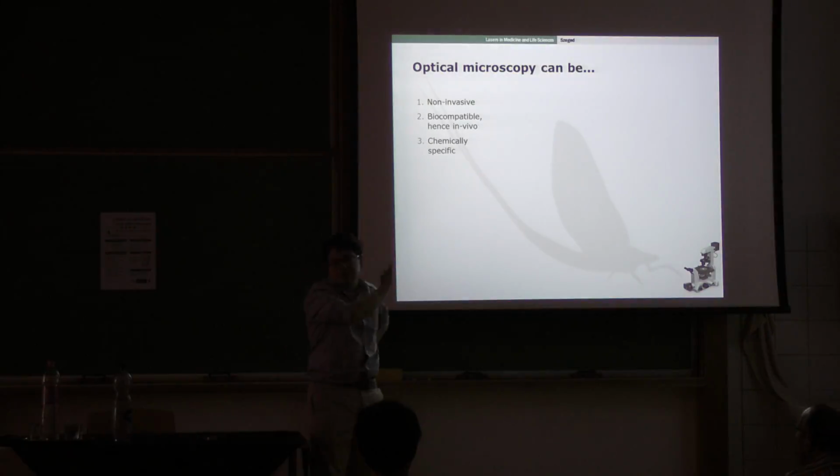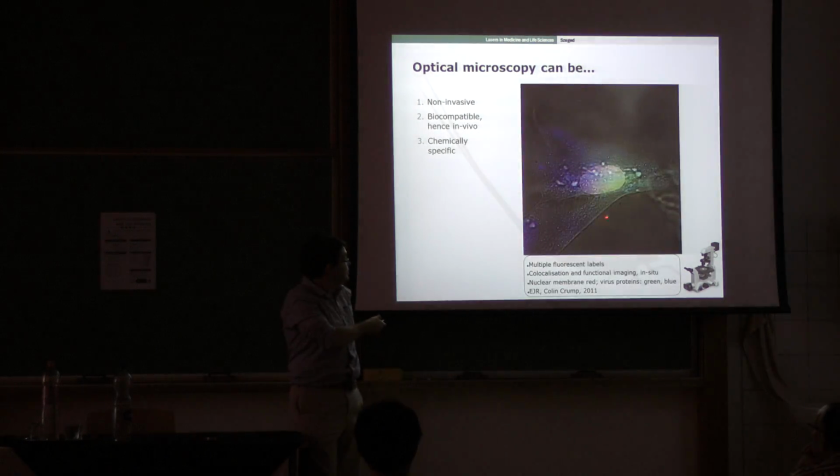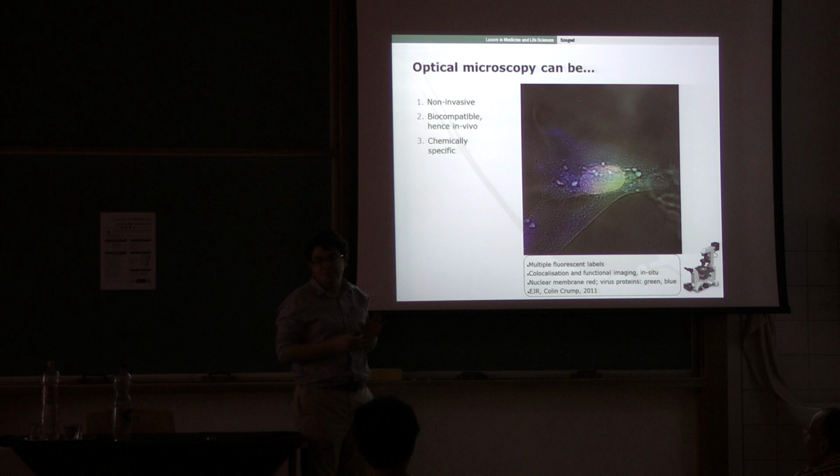just zooming out briefly, why do we want to do visible light super resolution microscopy? Well, this is because optical microscopy is absolutely essential. It has been and it still is. It's an essential technique for all kinds of biological and medical research, for the main reason that light can travel through the air and it can travel through water, which means it can basically travel through living tissue, at least to some extent. So we can use light microscopy to look inside biological samples, and we can look inside samples when they're living.